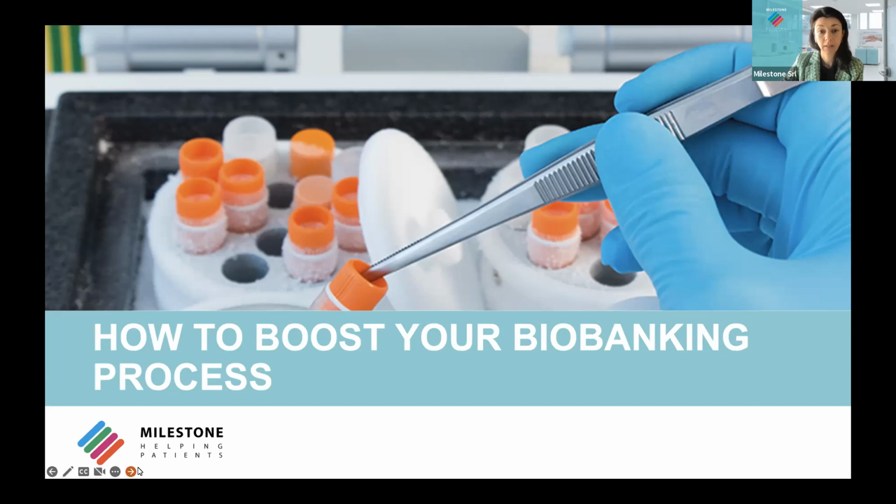Today we are here for our live webinar titled How to Boost Your Biobanking Process, and we will discuss together the different freezing methods and how to improve your biobanking workflow.